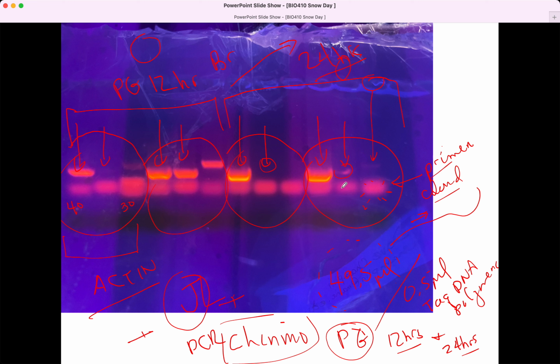If we let this gel run further, the primer clouds actually disappear. I only run these gels really fast, for 20 minutes, like that. So we always see these primer clouds. And going back here, you can see really consistent primer clouds here, and then some different amounts here, maybe in the first sample, maybe a little bit different like that. But so that's where we're at on that.